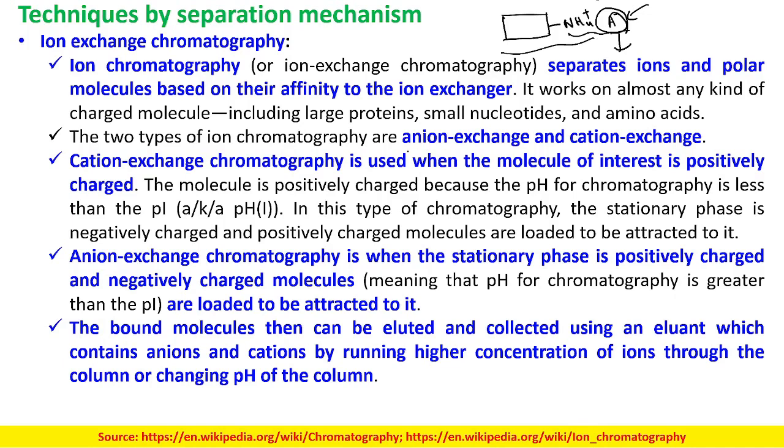Accordingly, we have anion exchange and cation exchange chromatographic techniques. So the cation exchange chromatographic technique is used when a molecule of interest is positively charged. Okay, and the anion exchange chromatographic technique is used when the stationary phase is positively charged and negatively charged molecules are loaded to be attracted to it. So the example I have given you is an example of anion exchange chromatography.